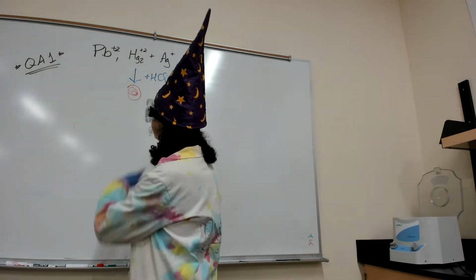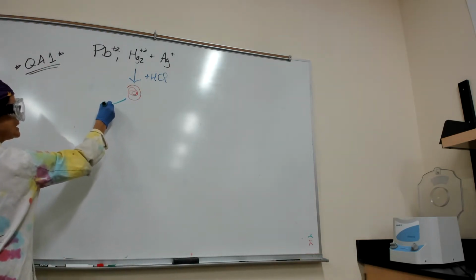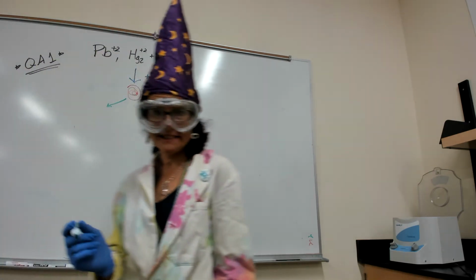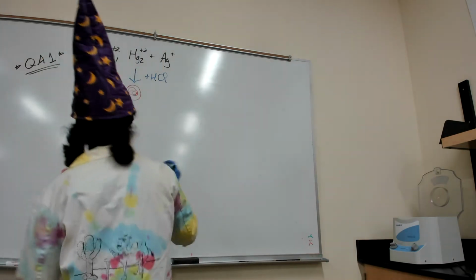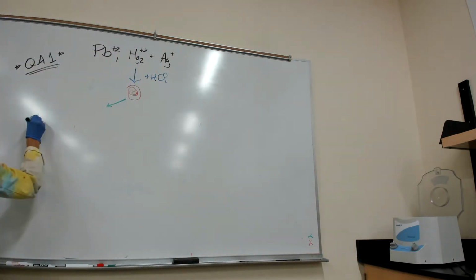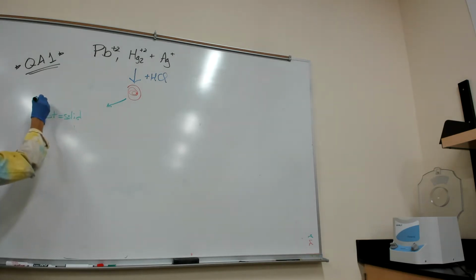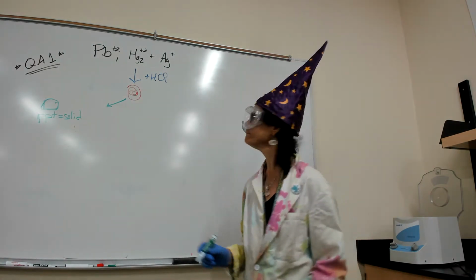All right, so what happens is we separate it. On one side, we get the precipitate. The precipitate is the solid. Let's see if you see it over here. So PPT is the solid. I'm going to use a symbol for it, like this is my rendition of a rock. It's just sitting there. It's like a pet rock.